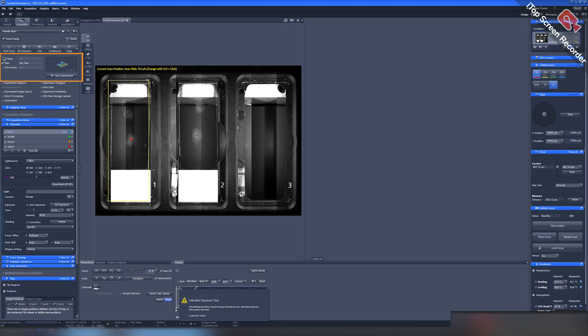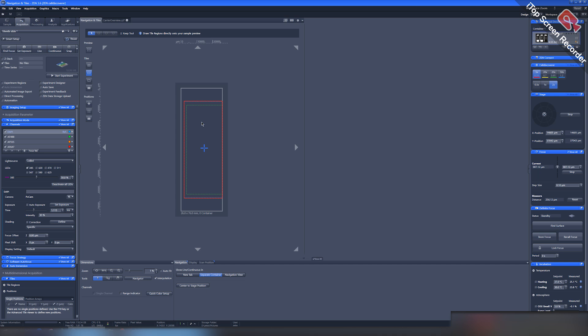Then activate the Tiles option below the Find Focus button in the top left part. This option allows us to navigate and mark areas of interest for scanning.